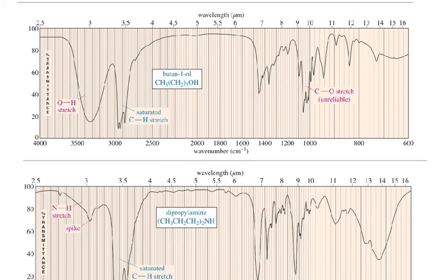Here are some examples. This, I believe, is the spectrum we first looked at in the beginning, when I said you can see the part that says OH. Now we know there's an alcohol, and we know why: at 3300 wave numbers we have this broad signal, and that tells us we have an alcohol. We can also see that we don't have any alkene, because there's nothing right there.